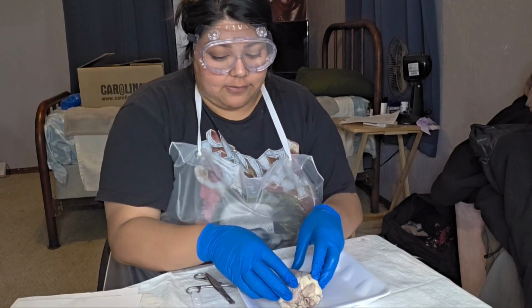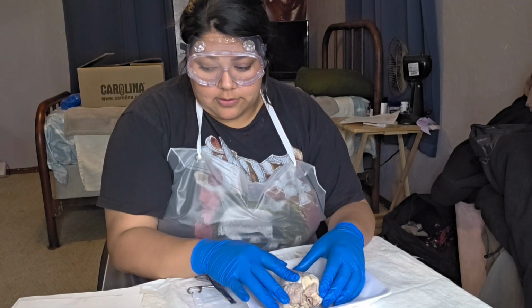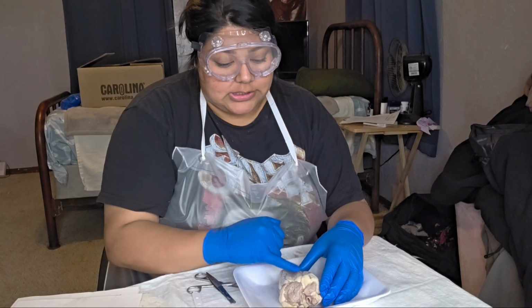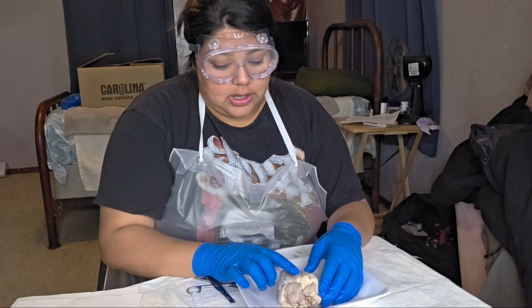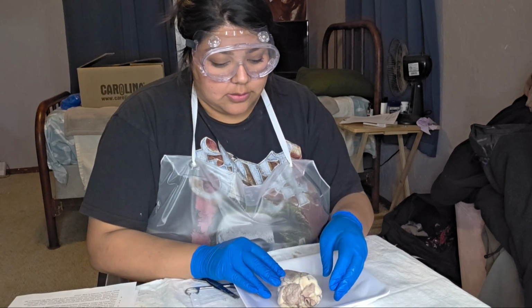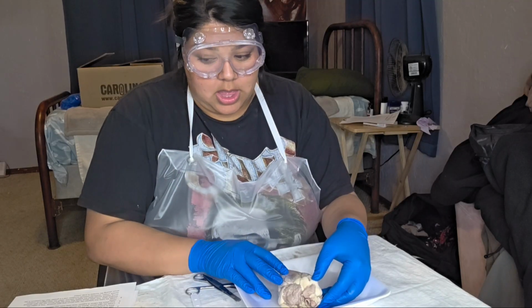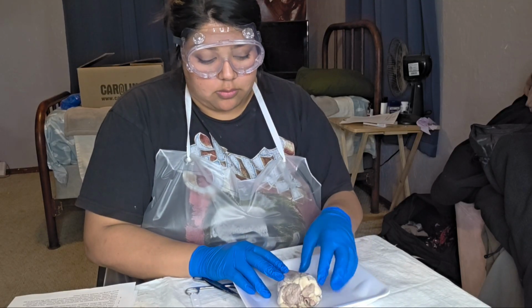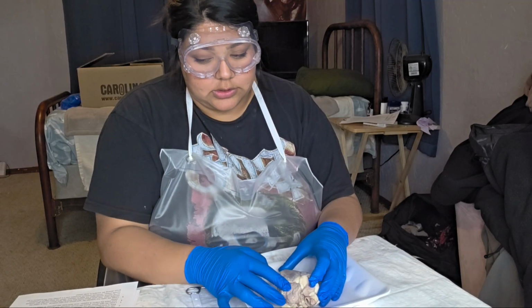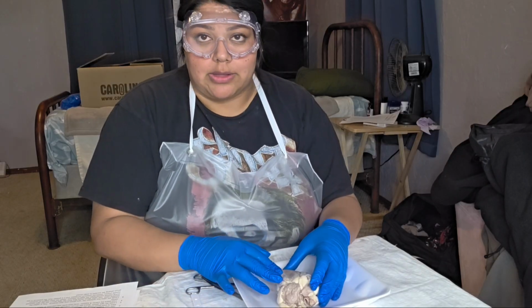With the heart in the dissecting pan facing you, we know that it's right side up, or ventral side towards us, because of the major arteries that we can see running through here, the coronary artery. At the right here, we can see our right atrium and our right ventricle. Down below it, we can see our left atrium and our left ventricle.